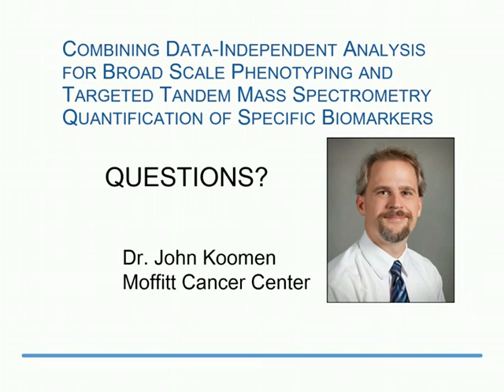Okay, I think we just have a couple more here we can take in our time. Next is, how does a shorter gradient affect the detection of total protein number across a specific pathway? Yeah, so we've started looking at that, and you lose the ability to detect individual peptides much more rapidly than you lose the ability to detect proteins.